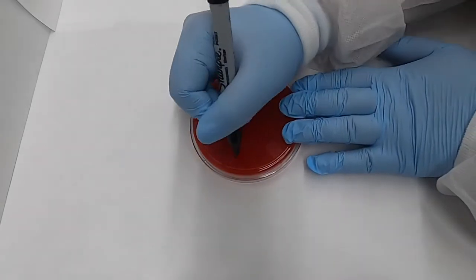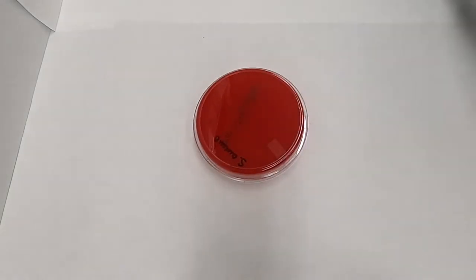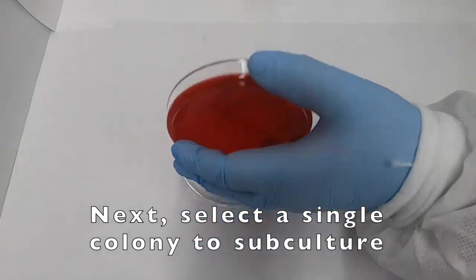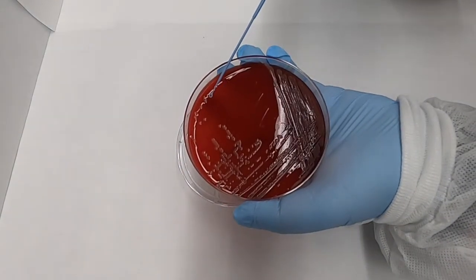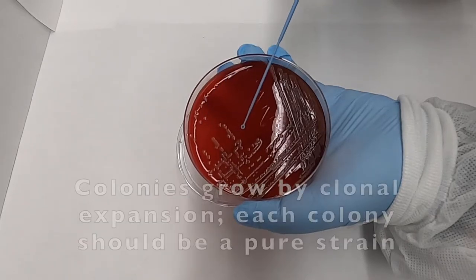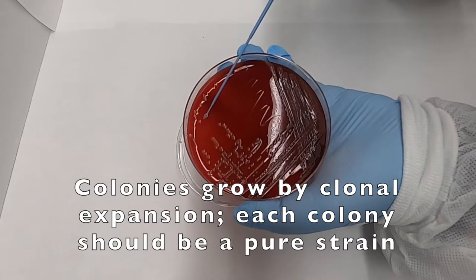When performing a subculture, the first step is to label your fresh blood agar plate so that you know where your culture came from. Next, we select a single colony on our primary plate that we want to subculture. It's important to select just one because we want it to be clonal and genetically homogeneous.